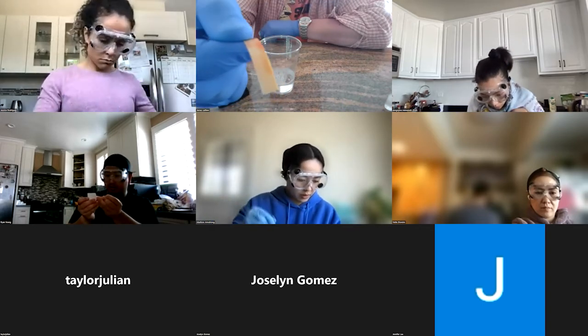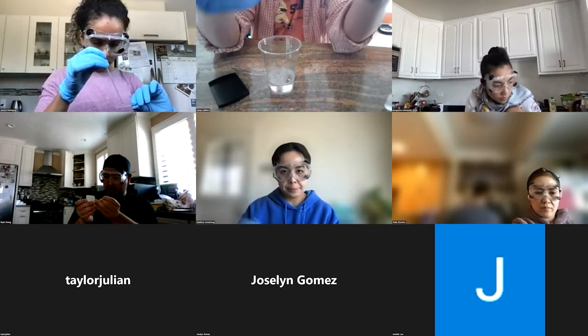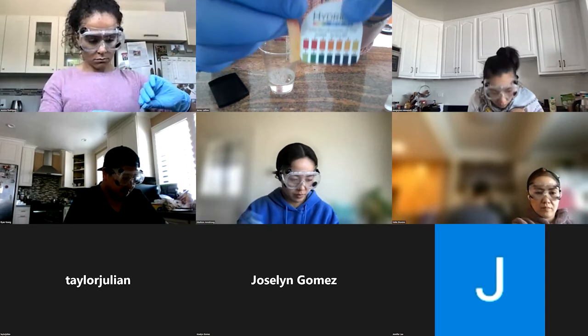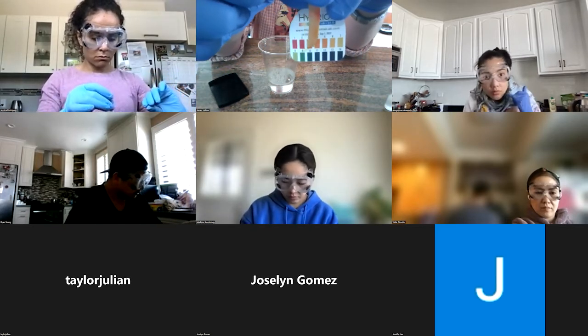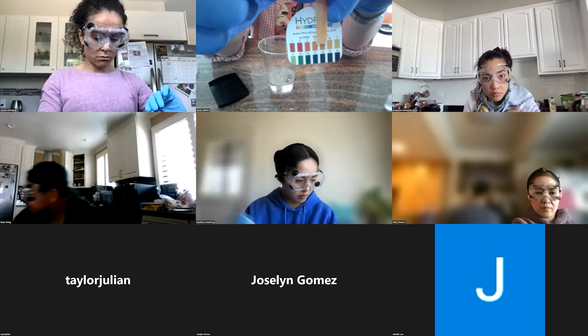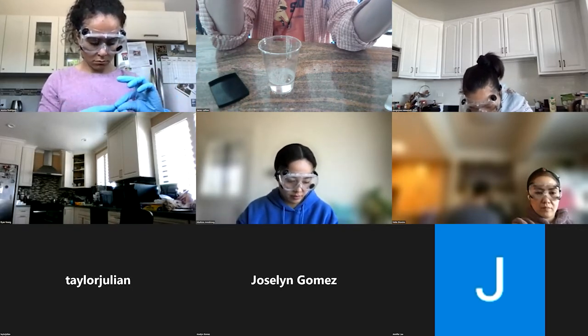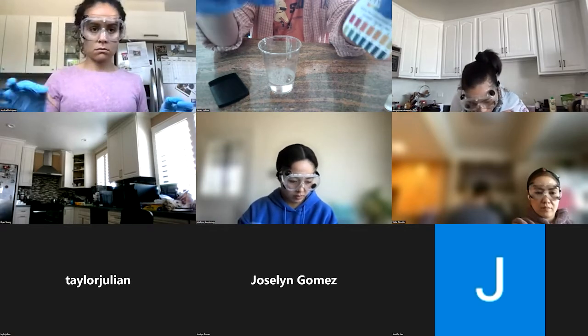So it looks like, if I hold it up, probably about there. Looks to be about the match. So I'd say this is probably between pH 6 and pH 7.